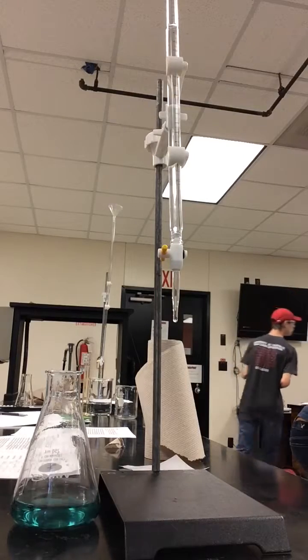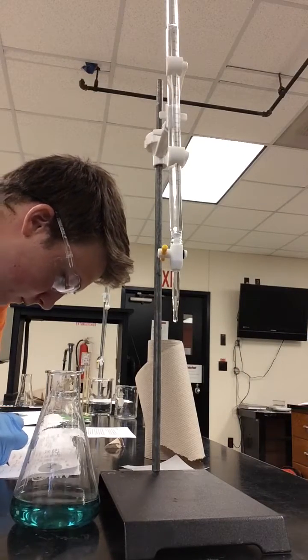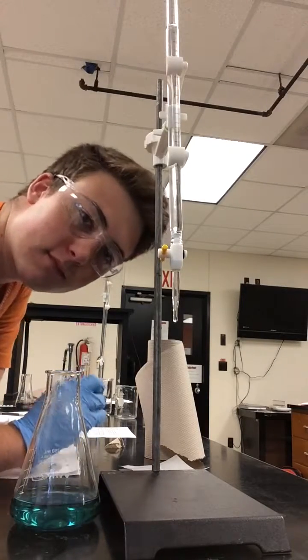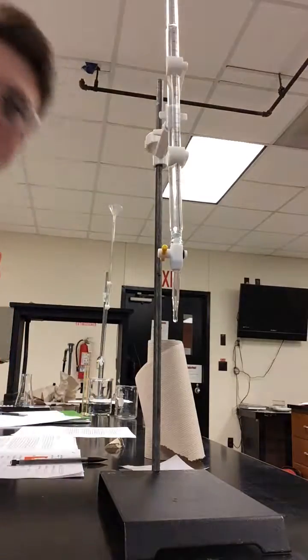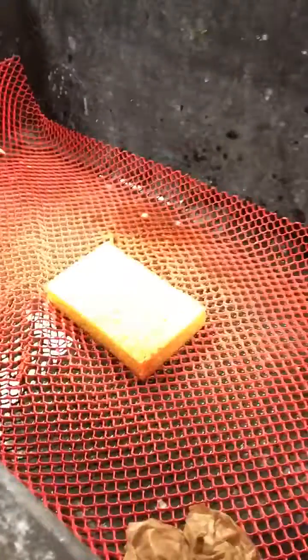So my first one was at 3, and then it went about 13, so the next one should be about 33, but I'm already at 3.1. And we do it again.